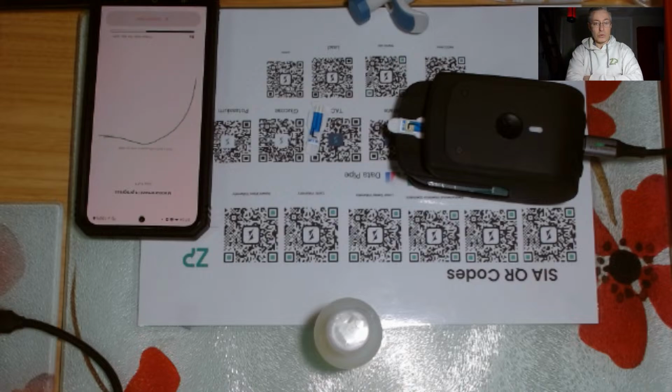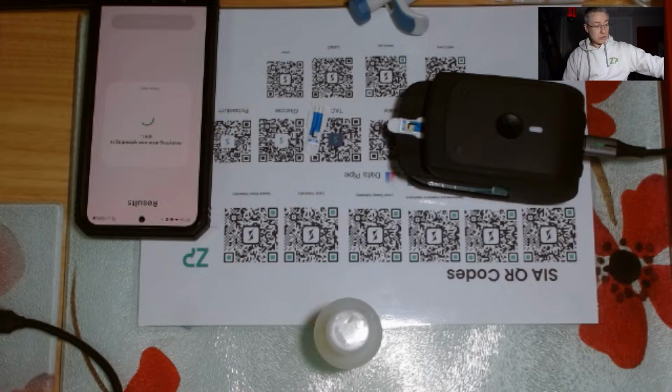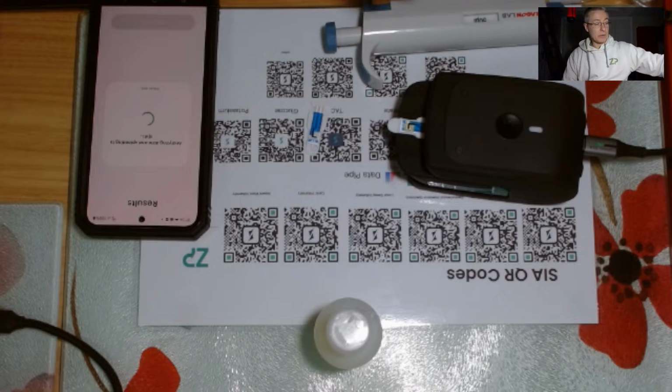It's not at all, I don't want to trivialize it, but it's not at all, well, I could trivialize it. It's not at all hard. And it's something that we definitely do quite a lot of. And as I say, in this particular case, we were doing an analysis of a third-party electrode, but we didn't get the data quality that we expected.